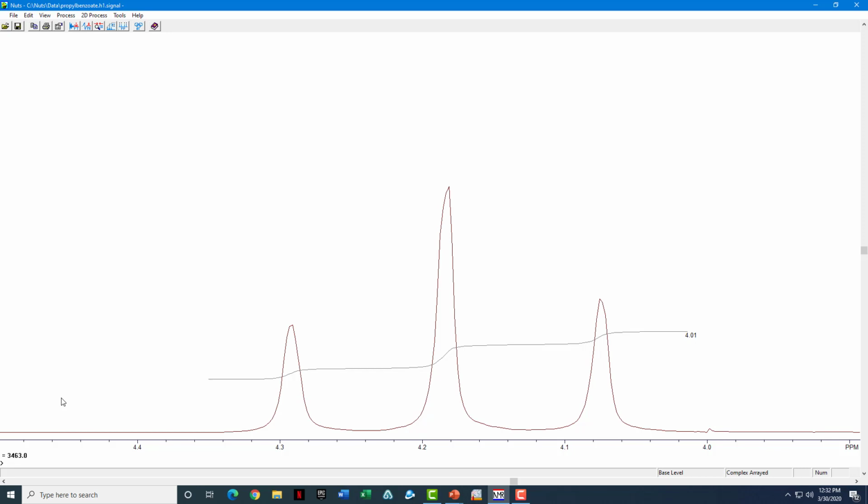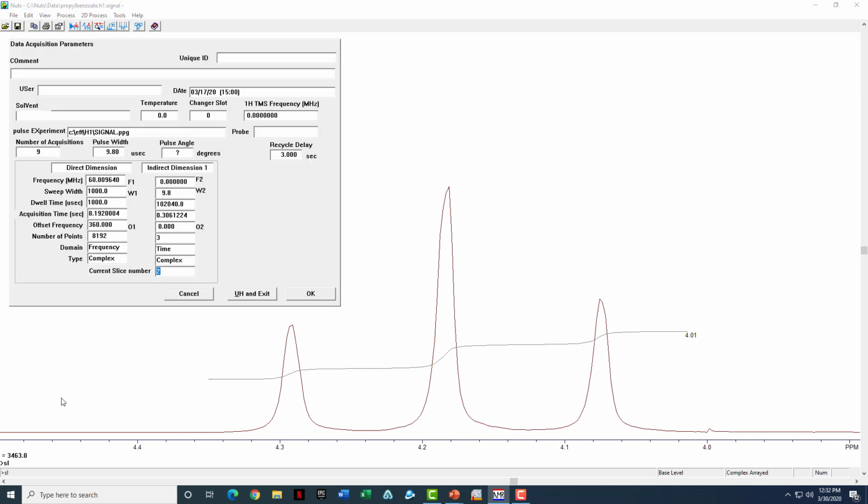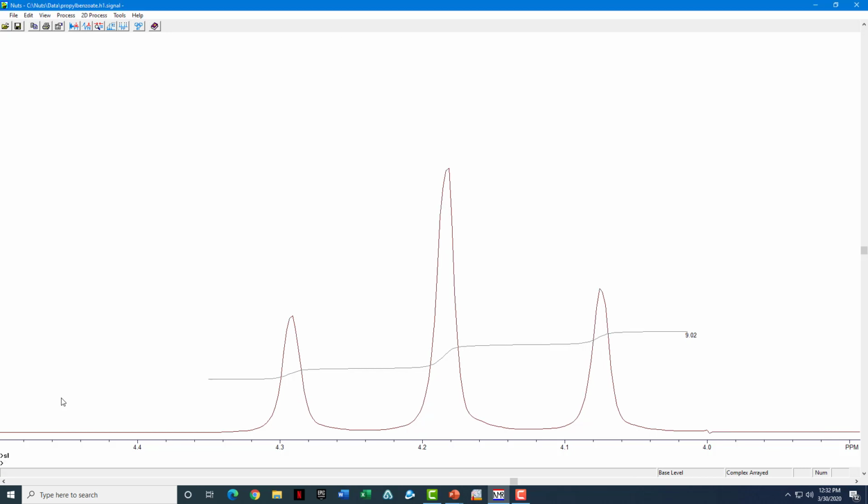From what we've seen so far, we can expect that doing 9 times the number of scans, the signal to noise should scale as a square root function of that. We should get 3 times the signal to noise. So we'll go to slice 3, signal to noise. 3 times 1700 is 5100. We're getting almost exactly 3 times the signal to noise.